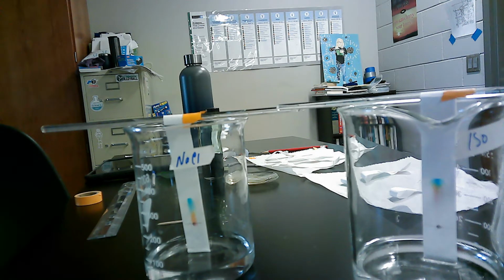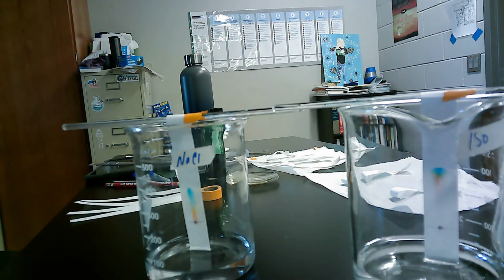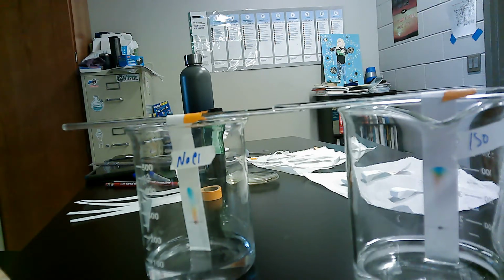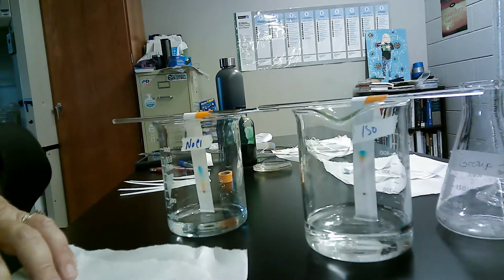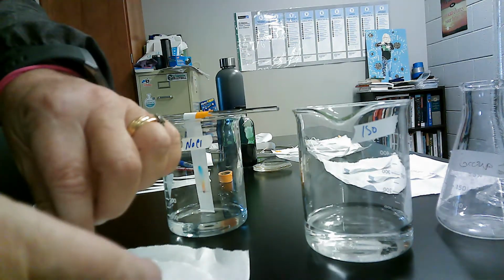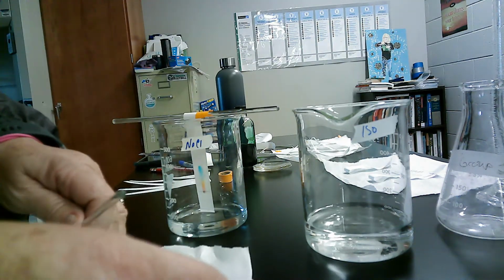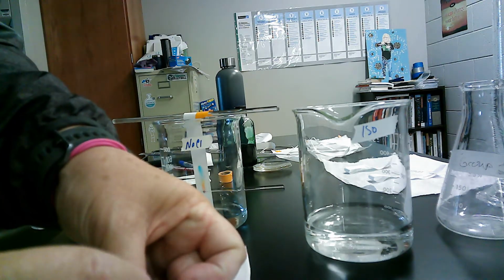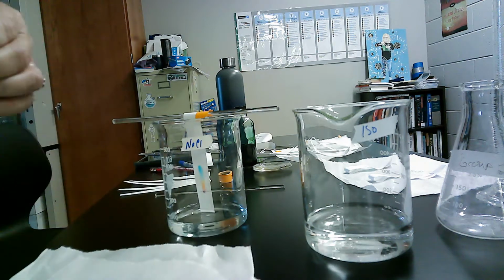So we'll pause again and then we'll come back. All right, so for the convenience of time and not letting it go too far, we're going to stop at this point and remove our papers from the solvent. We do want to let them dry, but sometimes when they dry, some of the colors fade. So we need to be able to do measurements with them.